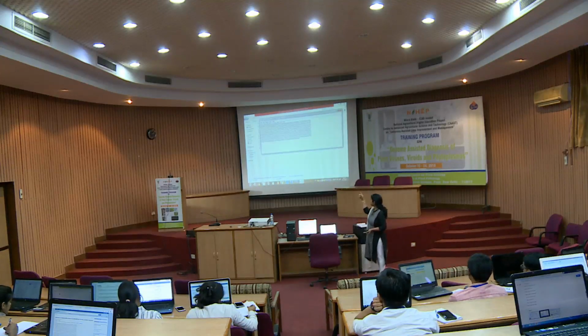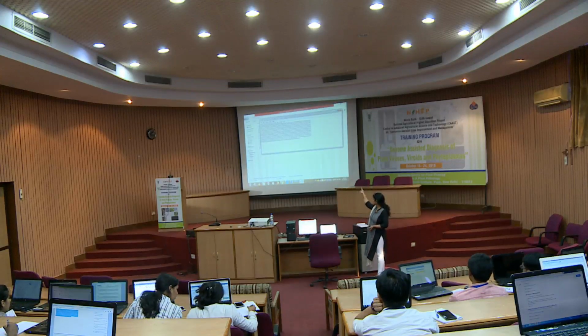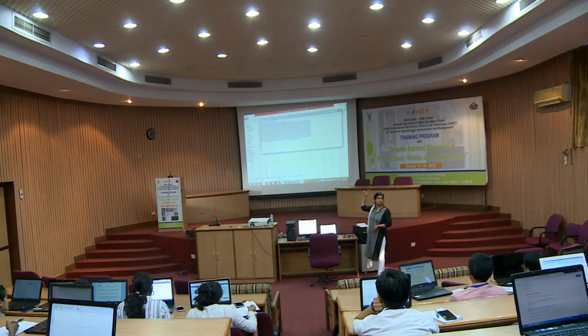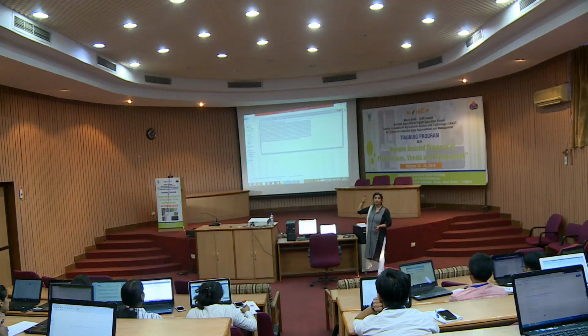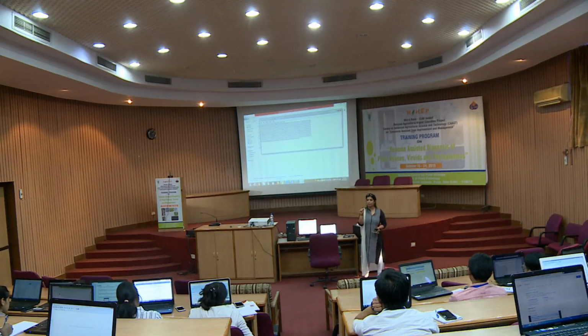So, never ever just take this and go ahead saying, "Yes, my data has come and now I can use this data," because there will be lots and lots of errors in this ACGT, right. If the data is mixed, then also the machine will pick one of the bases, A, C, G or T, right.